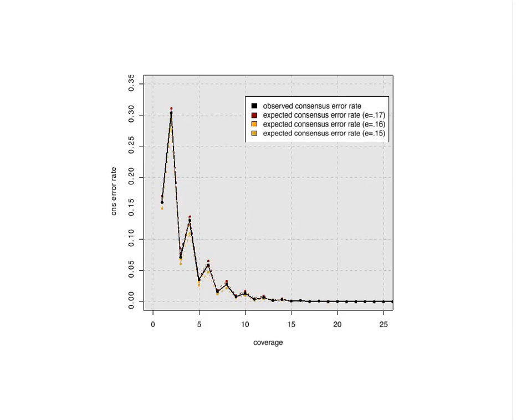I think that's one of the main differences between our two approaches, that we can automatically scale sort of agnostically with the read length, whereas there it becomes more computationally expensive. And I'm sure as PacBio reads grow longer, they'll adapt their assembler to work with that as well. But at the current, at least the state of the art, the way it is now, they rely on shorter PacBio reads than we do.